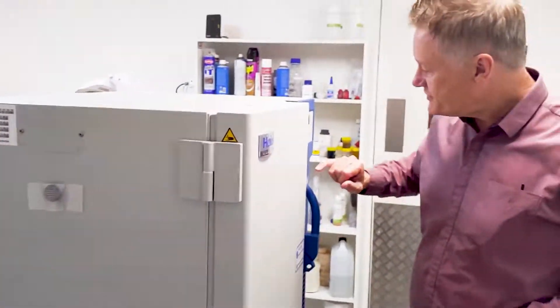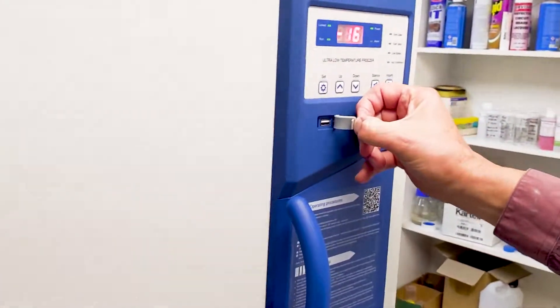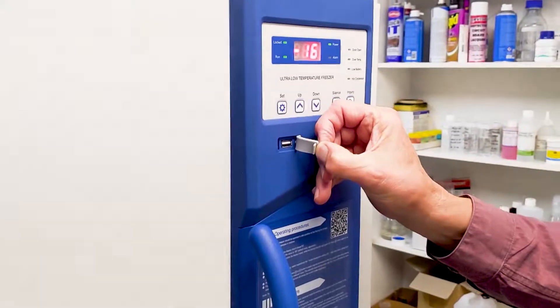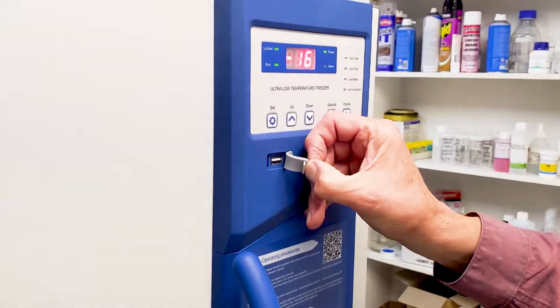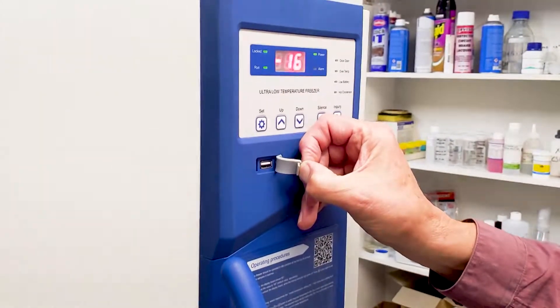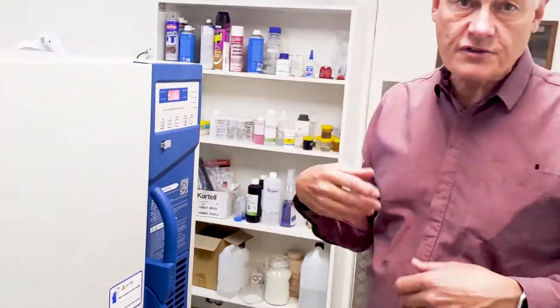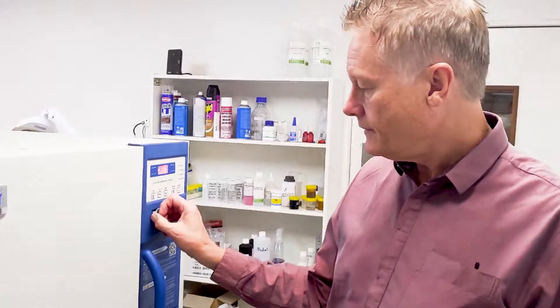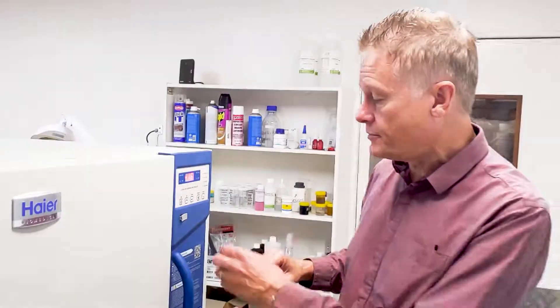On the front of the system there is a USB port where you can download the operating history of the freezer for whatever designated period. You can also tell it in the programming how often you want it to take a temperature reading — that might be every hour, every minute, whatever the case might be. Obviously the more recordings you take, the more data and memory is used in the process.